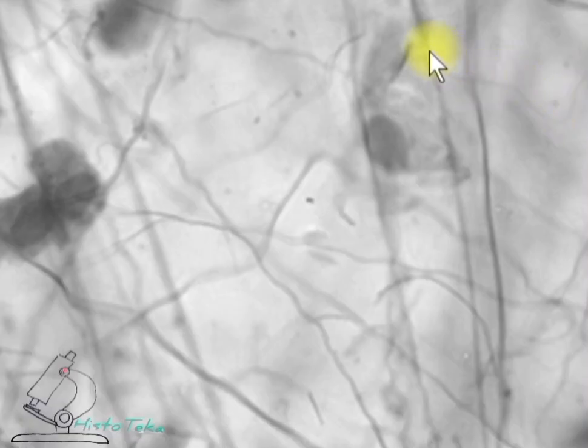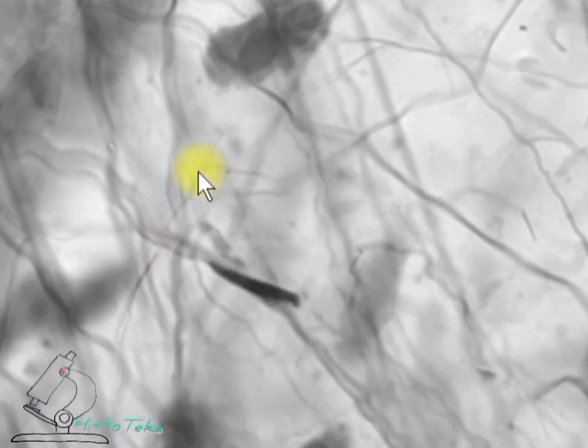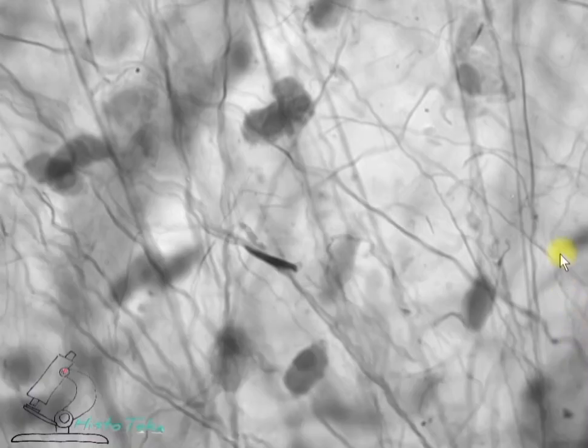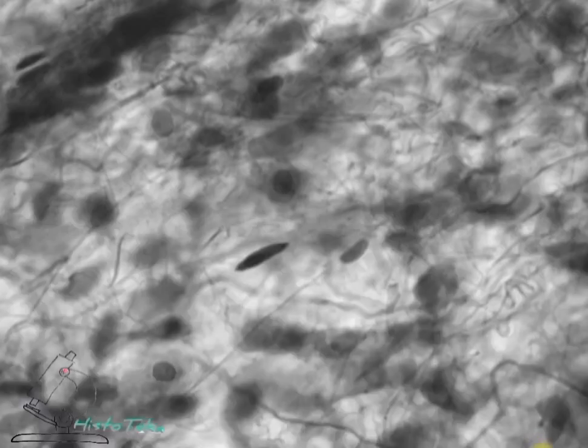Elastic fibers are thinner than collagenous fibers, and they are highly elastic, composed of branched tubular fibers of the protein elastin. They are yellow in color. On the preparation they are thin, branching, and can be straight or convoluted.